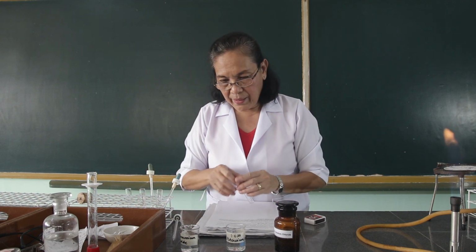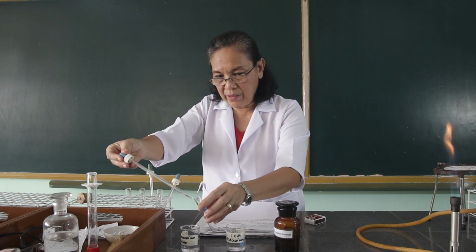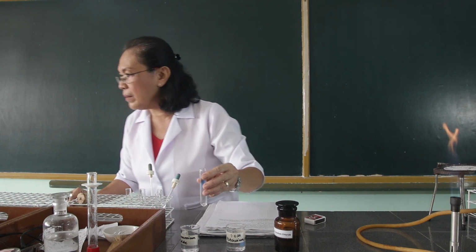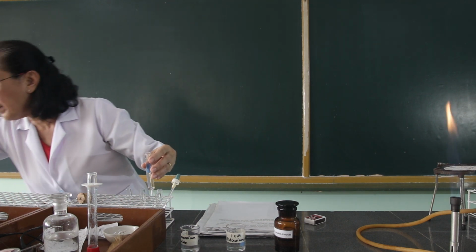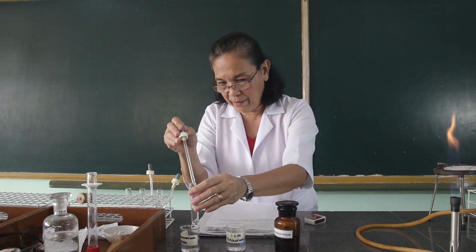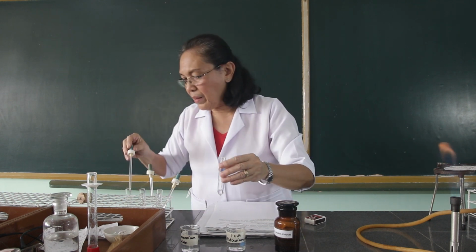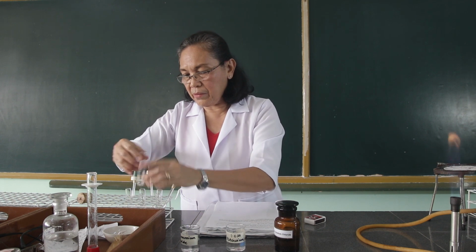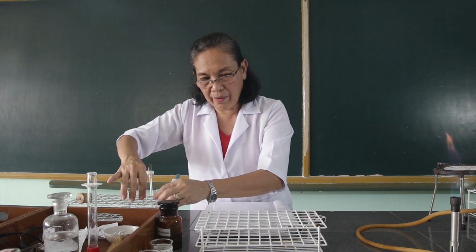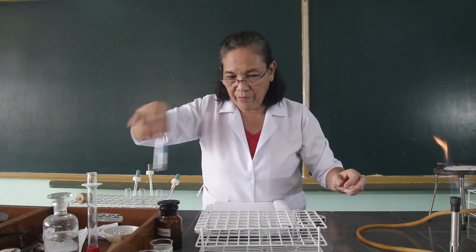Then let's get 1 ml of the ammonium chloride. Okay, ammonium. Sodium chloride, potassium chloride, ammonium chloride.